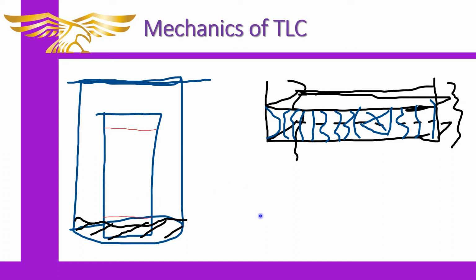And so these are some simple drawings that I've made. I know they're probably not the best drawings in the world, but they give us a general idea of some concepts that we need to understand about mechanisms here. With the TLC plate, what I've drawn is the plate as if you were holding it in your hand, looking across it, with the thin part being what I'm looking at. Let's pretend that this is a 5 by 10 centimeter plate. The 5 by 10 centimeters will be the area on the top, and this less than half a millimeter space here is what we're looking at.